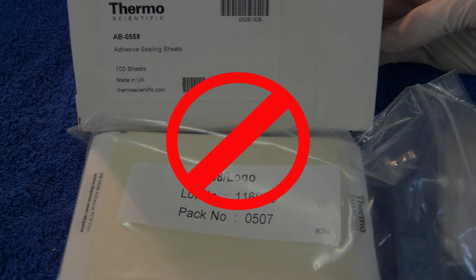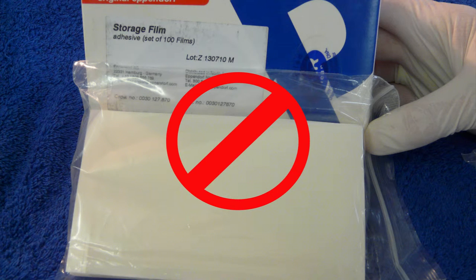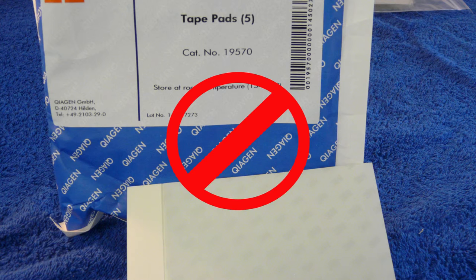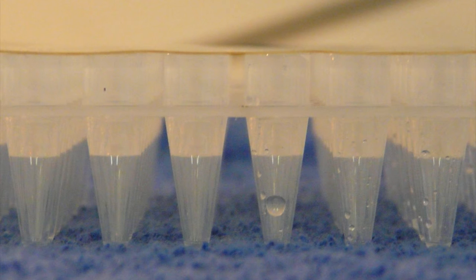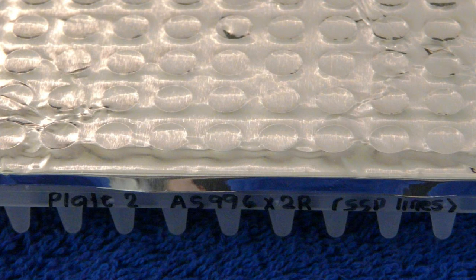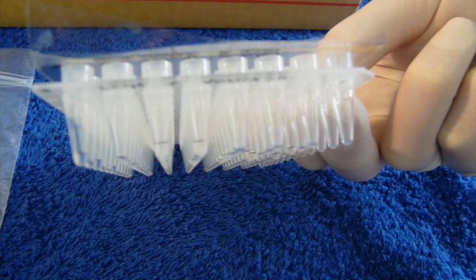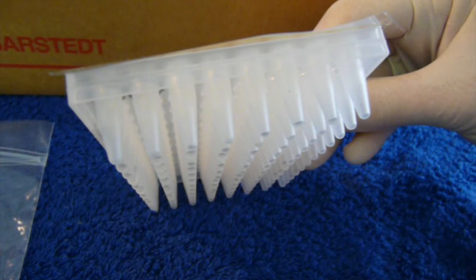Using non-skirted plates or semi-skirted plates with heat or adhesive seals, which are not recommended, will result in DNA leaking, resulting in varying volumes of DNA and cross-contamination. Following are some samples of non-recommended plates and seals showing you how the DNA arrives.